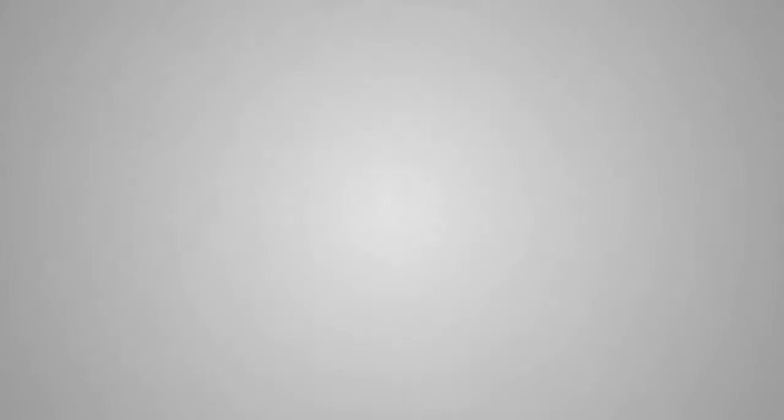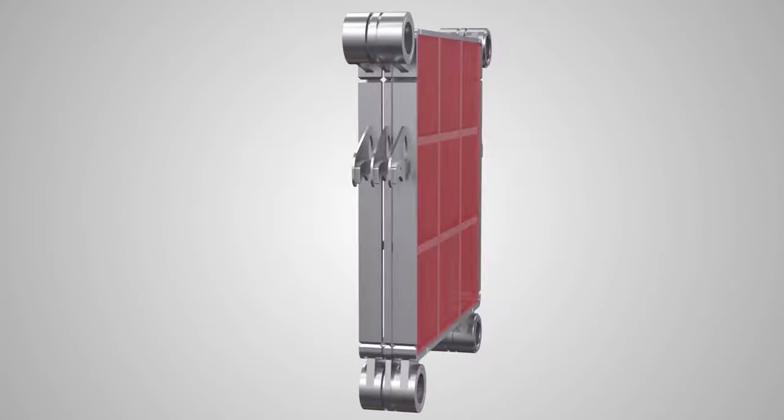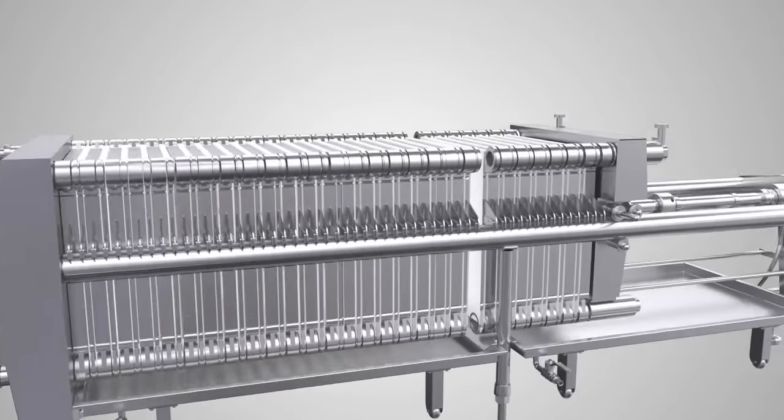The air vent helps avoid any air contamination as well as effective pressure development. The impurities are retained in the form of a cake on the sides of the frames. The sockets are provided with silicon rubber washers for effective sealing.